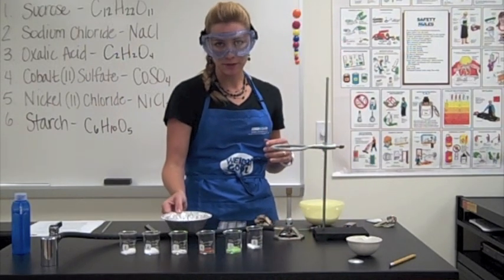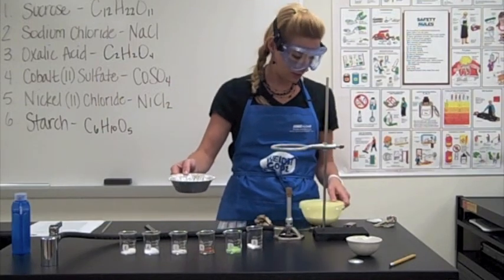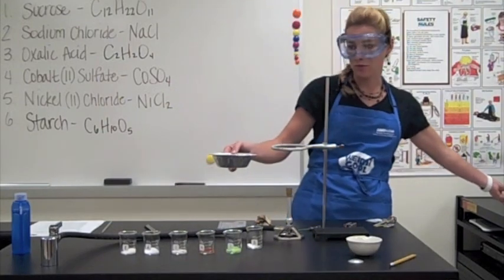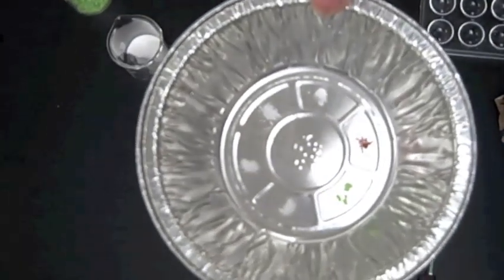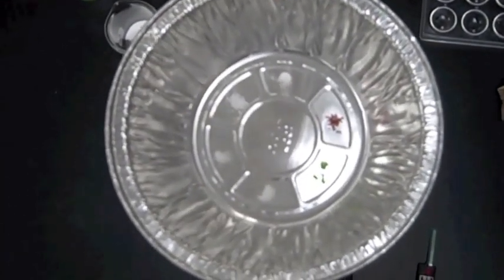Now, we're going to set it up here. And as soon as it hits the flame, some of them will melt almost immediately. So be ready. Here we go. Remember, we're just going with what melts.